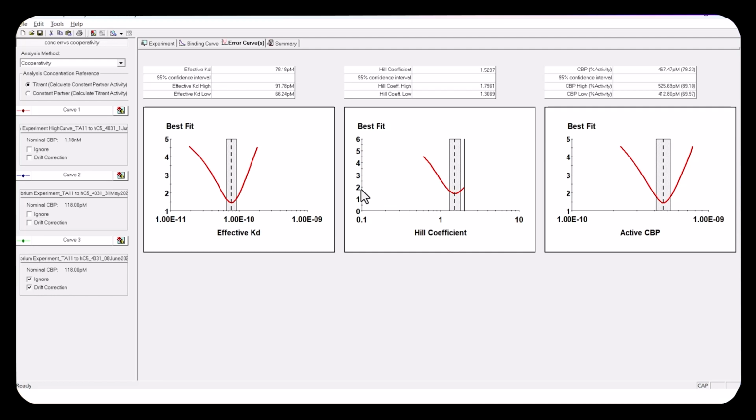You can, if you have 2 or 3 or 4 or 5, any number really, you can have cooperativity. But in KinExA, our cooperative model is limited to a valency of 2. So you cannot fit trivalent cooperative data here, but you can fit bivalent. But you can't fit monovalent because monovalent cannot exhibit cooperativity. So this model is simply wrong.